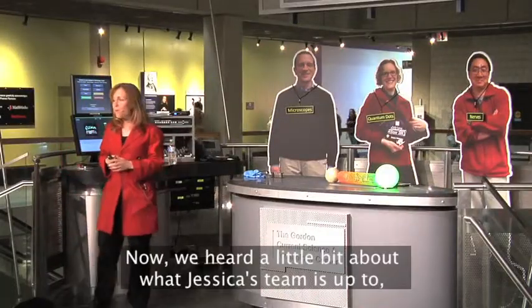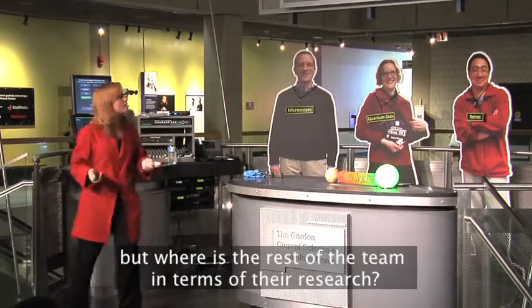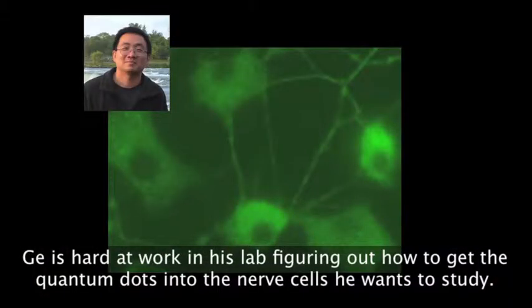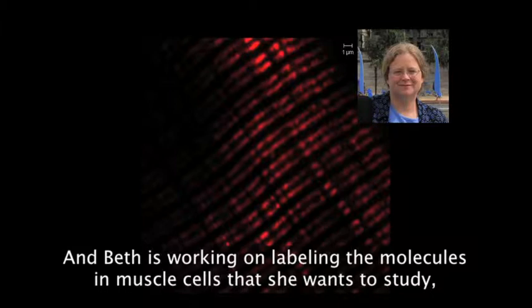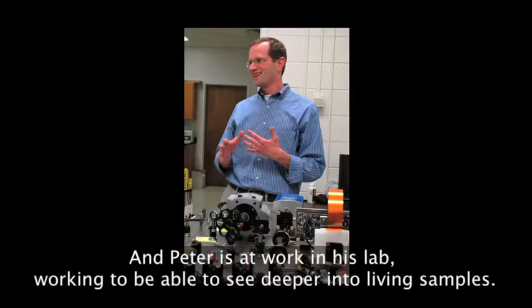Now, we heard a little bit about what Jessica's team is up to, but where is the rest of the team in terms of their research? Well, G is hard at work in his lab figuring out how to get those quantum dots into the nerve cells that he wants to study. And Beth is working on labeling the molecules in muscle cells that she wants to study and send the samples to Peter. And Peter is at work at his lab working to be able to see deeper into living samples.